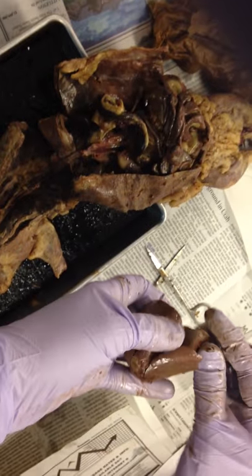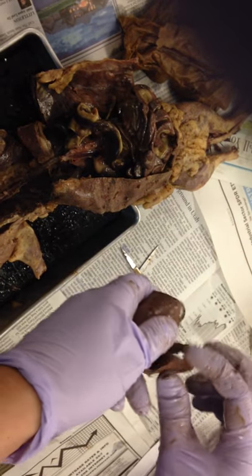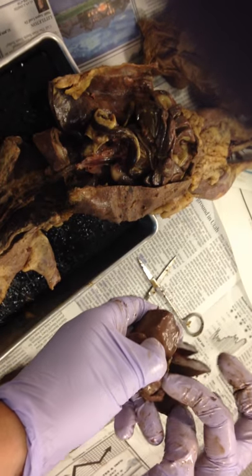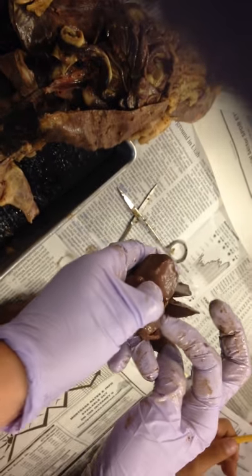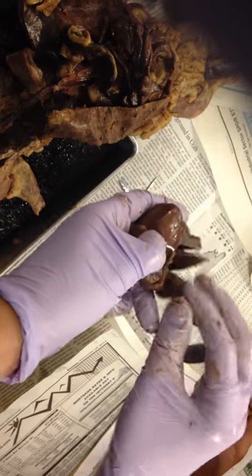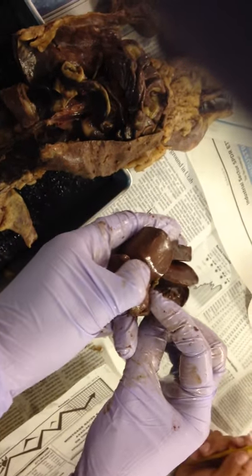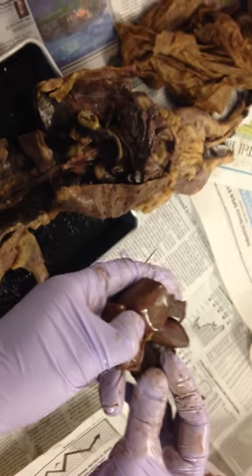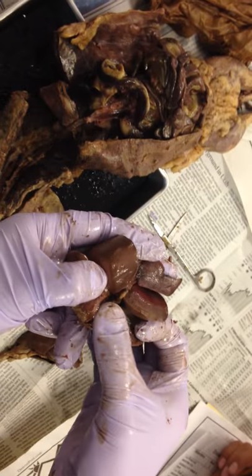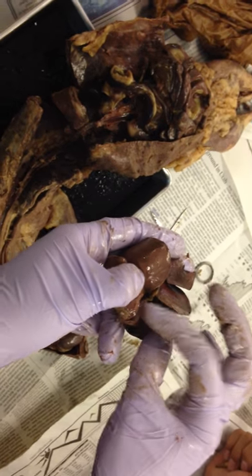Okay? Now, if you look under the second lobe, so if this is the first major lobe, you might have another little one down here, the second major lobe. When you peel that back, there's this little pouch right here. You see that little pouch? On yours, poke the liver, and then underneath the second one, poke that little pouch. This is your gallbladder. It should feel different. It holds the bile, and the bile is what helps your body break down fats. If I find a really good one in class, I'll call you over and have you poke it real gently. Bladder just means a pouch, so that is just holding all your bile.